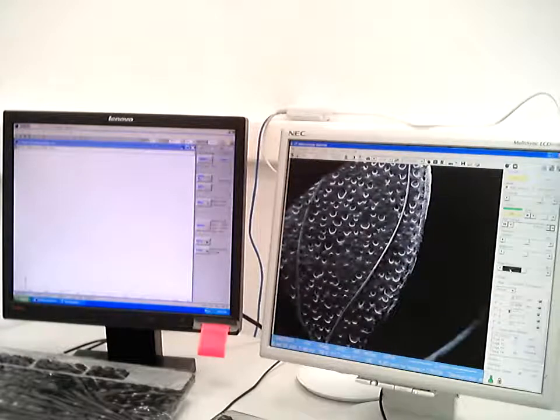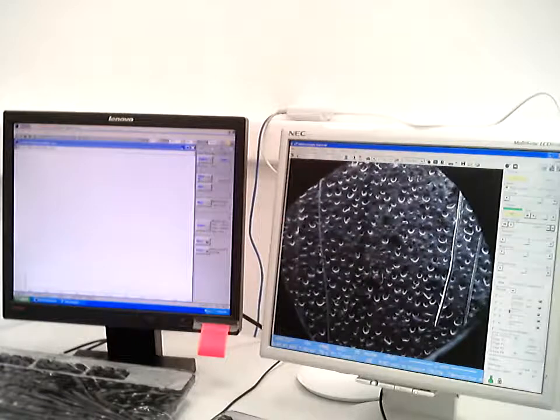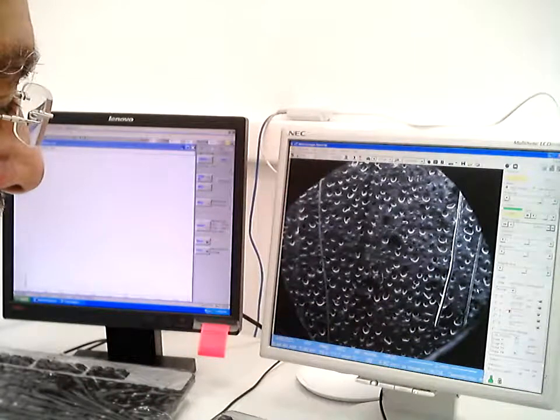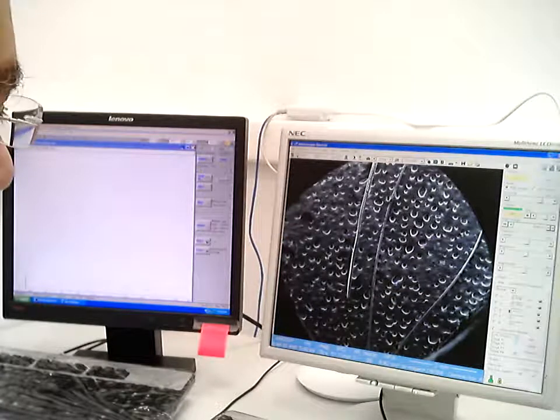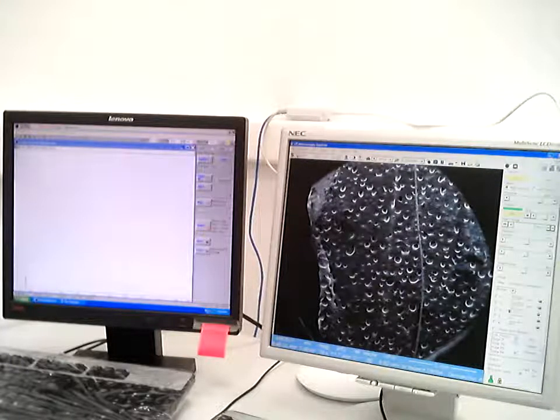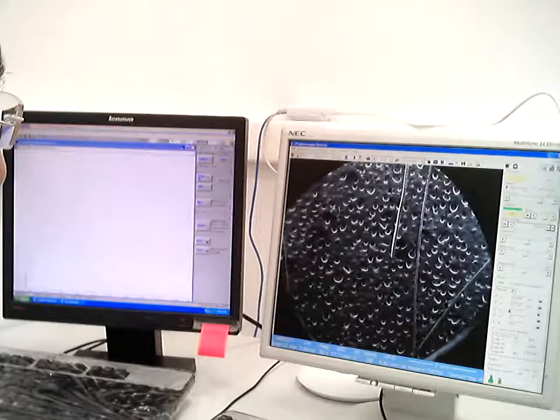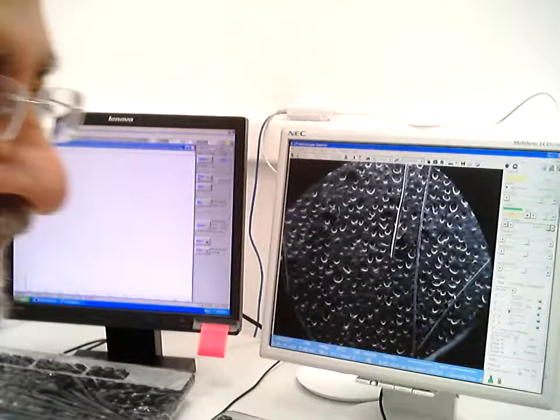Let's see if there are any other hairs that we can investigate. This is another human hair. Another thing about cat hair is that it is extremely straight. So this is curved, so this is probably human hair, and this one is probably human. Let's see. No, this is a cat hair on the left or the right there. And anything else? No, we don't have anything else. So this is probably human. It's thin. It's a regular shape. And this is a cat hair over here. This one is definitely a cat hair. It's straighter. It has those pimples on it, and the striations, the cells, are different.